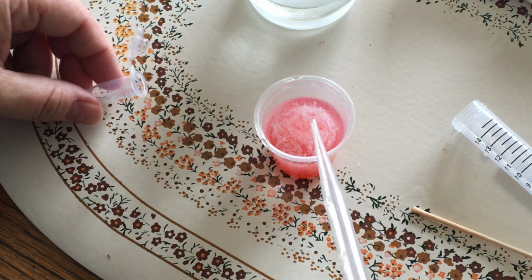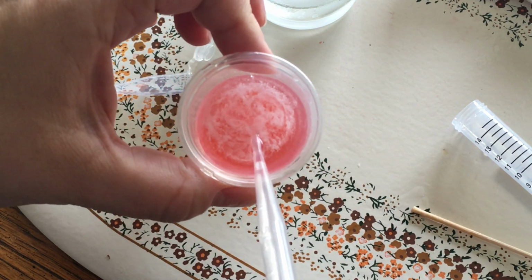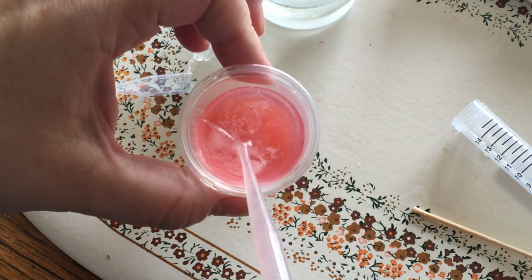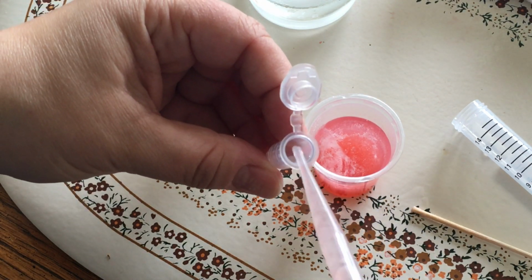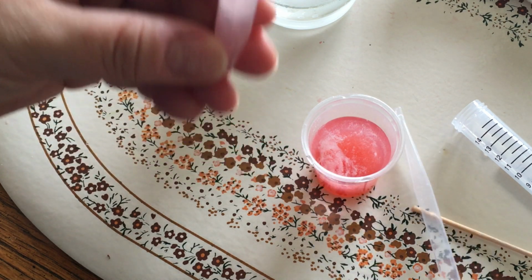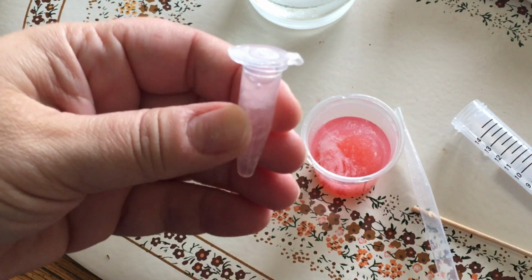So if you watch me here, we're gonna slowly, we want just the top part, not the bottom, so you're only putting it in the top. And you can see how I'm getting the DNA, right? And now, we're gonna just put it right into our capsule. And there we go. And now you're gonna seal it up nice and tight. Wait till you hear that click.